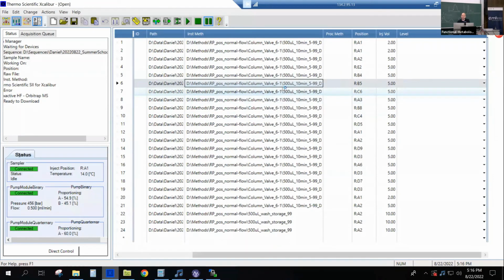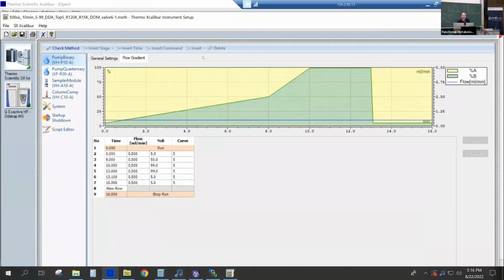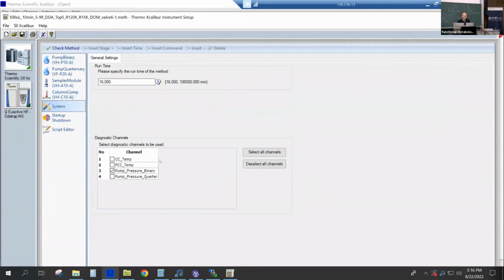For this one, it should be selected. That tells you a lot about your equilibration time and whether your pump works well, because any pulsation you will immediately see. We recently had problems with our check valves, and monitoring the pressure is perfect to take a look at that.